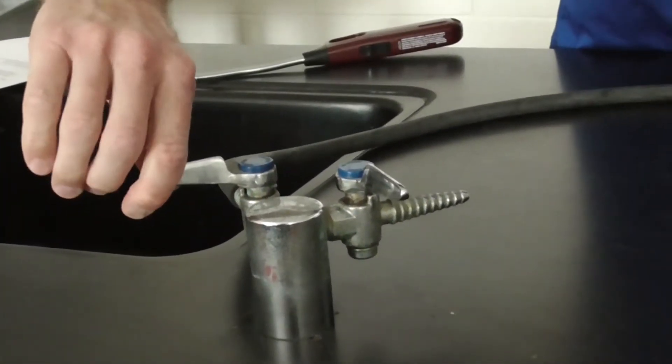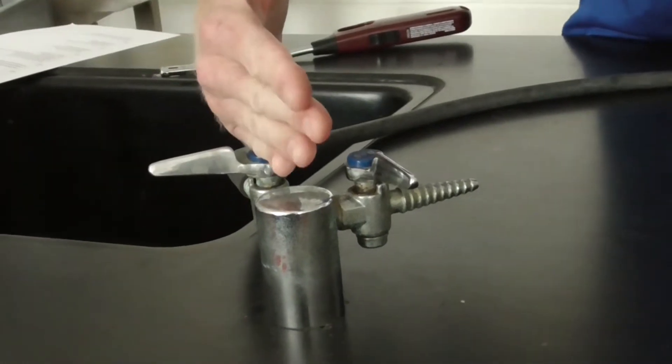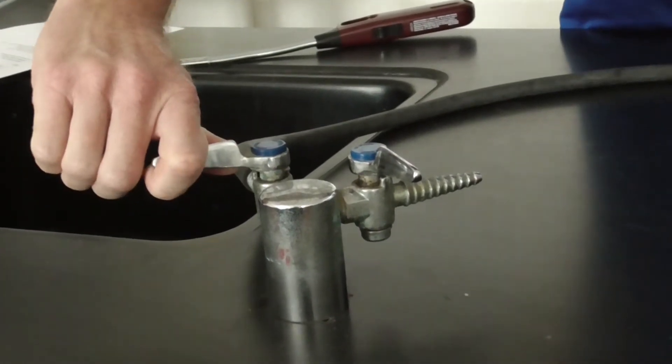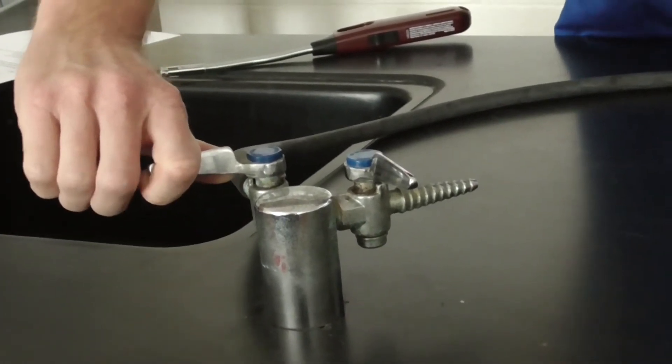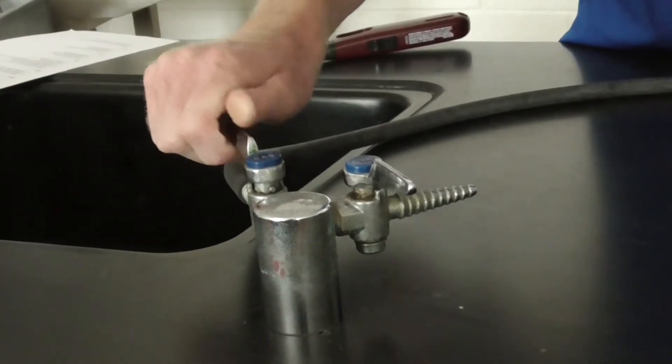The gas jet has a handle. When the handle is turned perpendicular to the gas jet, the gas is off. To turn the gas on, you would turn the handle parallel with the gas line.